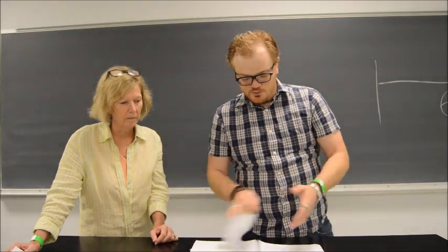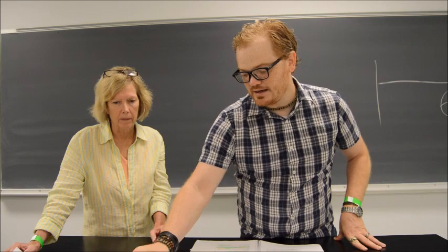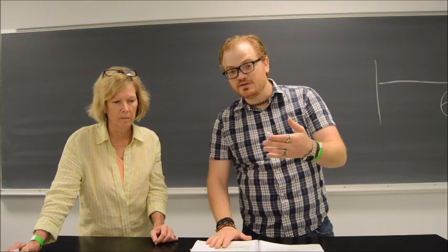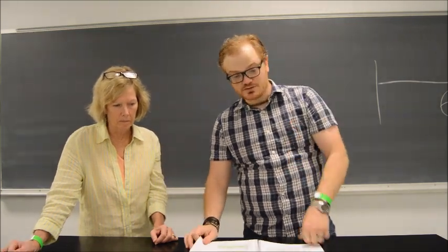Okay. So the way in which we do this, as we established previously, is with this Benedict's reagent and an iodine solution as well. And those will come up with a color change when placed in if these macromolecules are present. And we'll be showing you that here in just a little while.